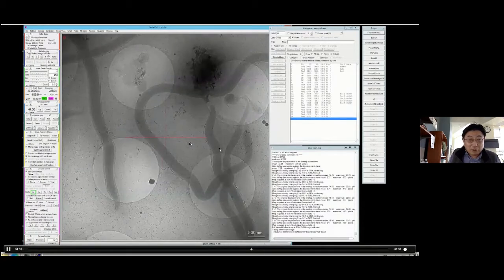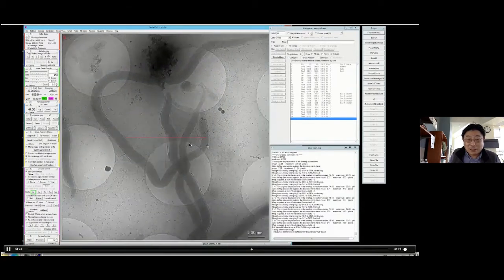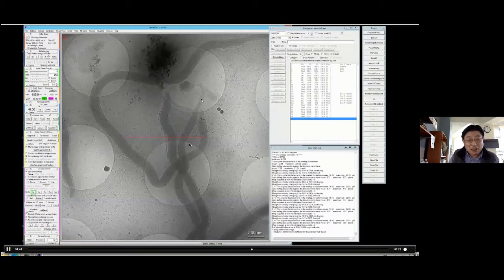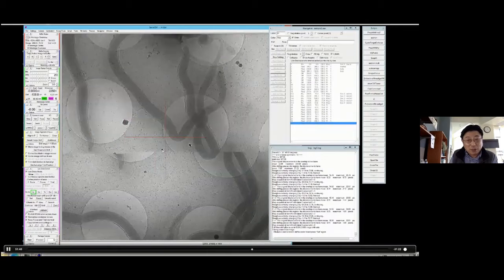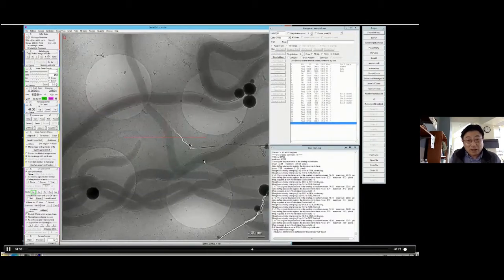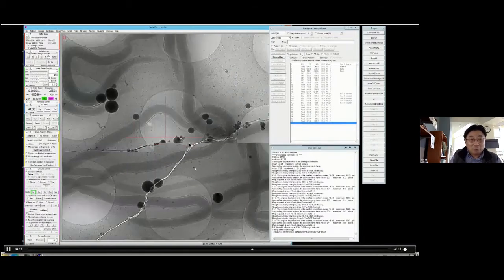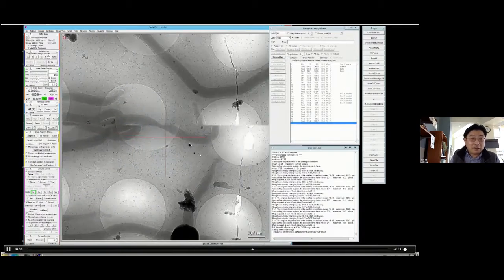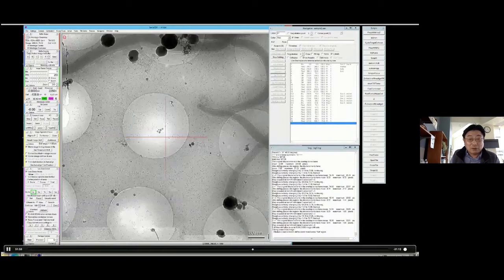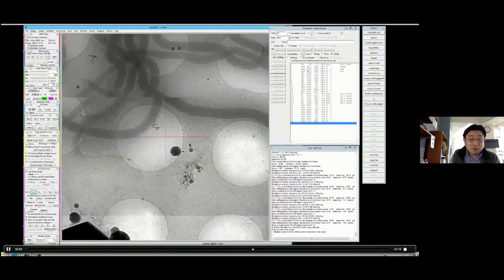So as I already said, the clock is on. Basically, the moment you start to use Titan, the time is on, so you really don't want to waste it. In our case, at 9 o'clock a.m., we have to switch to another user. If you cannot get anything done within the time, the next user will start, so your sample will maybe be wasted.